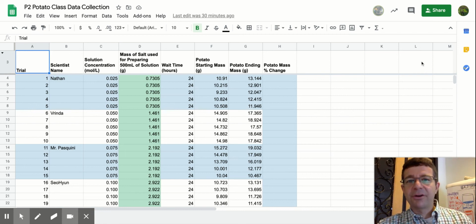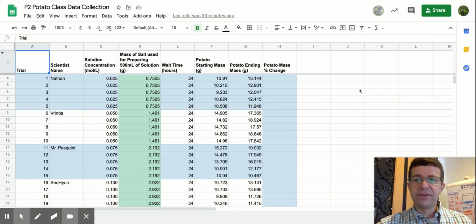Hi, I want to make a quick screencast of the steps that you'll go through analyzing your data. This is all shown inside of the document, but in case you prefer video, you might want to watch this. I'm going to try to go quickly, so please pause whenever you need to.